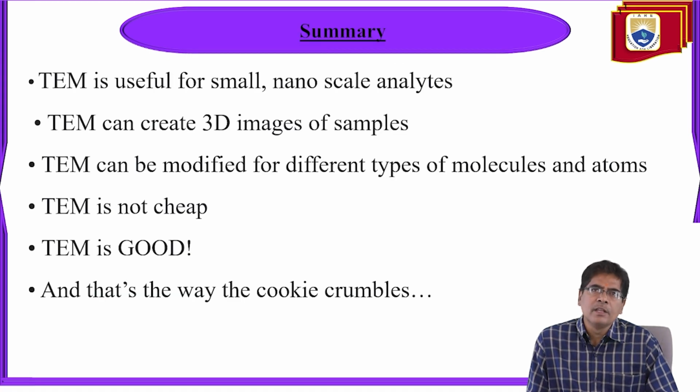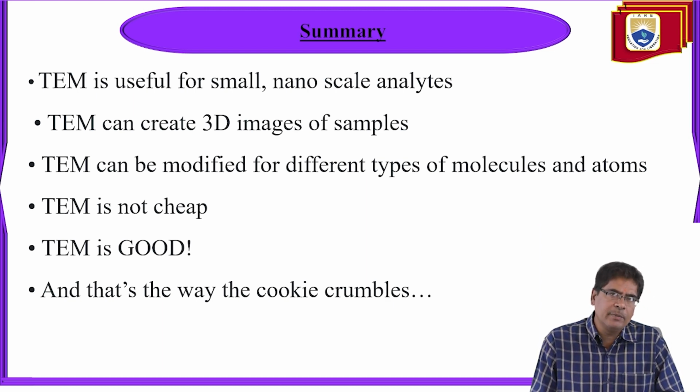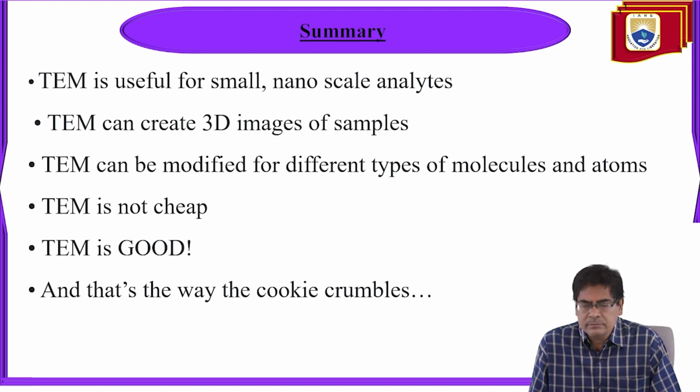If we come to the summary, overall TEM is useful for small nanoscale systems. TEM can create 3D images of samples. TEM can be modified for different types of molecules and atoms. It is not a cheap equipment. It's a very costly equipment. The transmission electron microscopy is good.